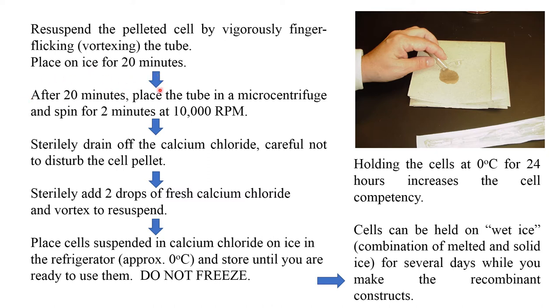After 20 minutes, place the tube in a centrifuge and spin for two minutes at 10,000 rpm. Then carefully drain off the calcium chloride without disturbing the cell pellet. Again add two drops of fresh calcium chloride and vortex to re-suspend. Then place the cells suspended in calcium chloride on ice in the refrigerator.